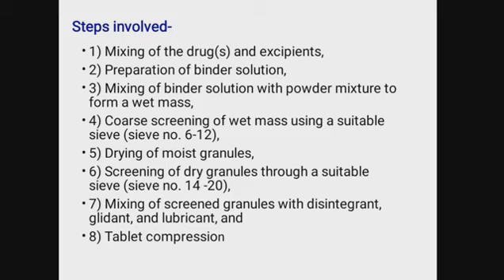What are the advantages of wet granulation? First, the agglomerates or granules formed improve the cohesiveness and compressibility of powders. Second, high-dose drugs with poor flow or compressibility properties can be prepared by wet granulation. Third, soluble low-dosage or potent drugs can attain uniform distribution and content by this process.